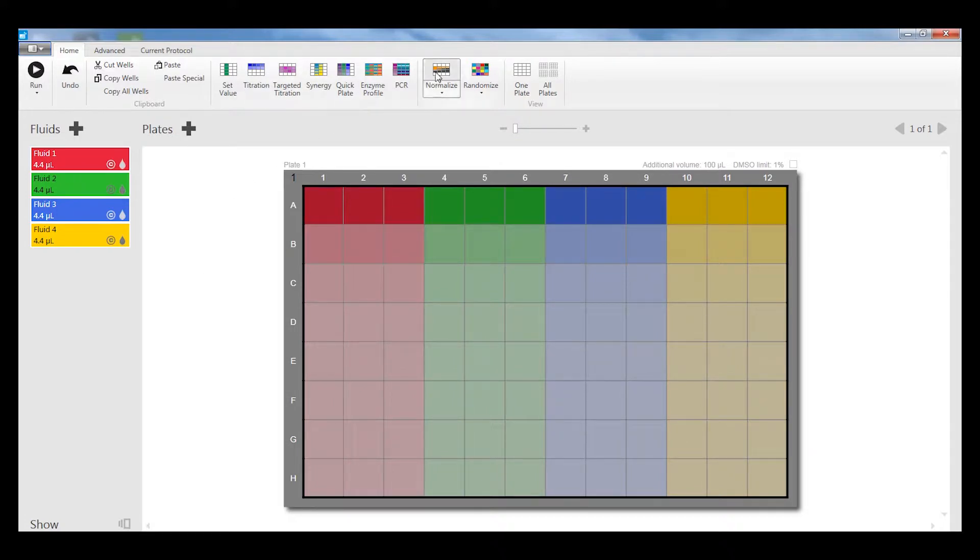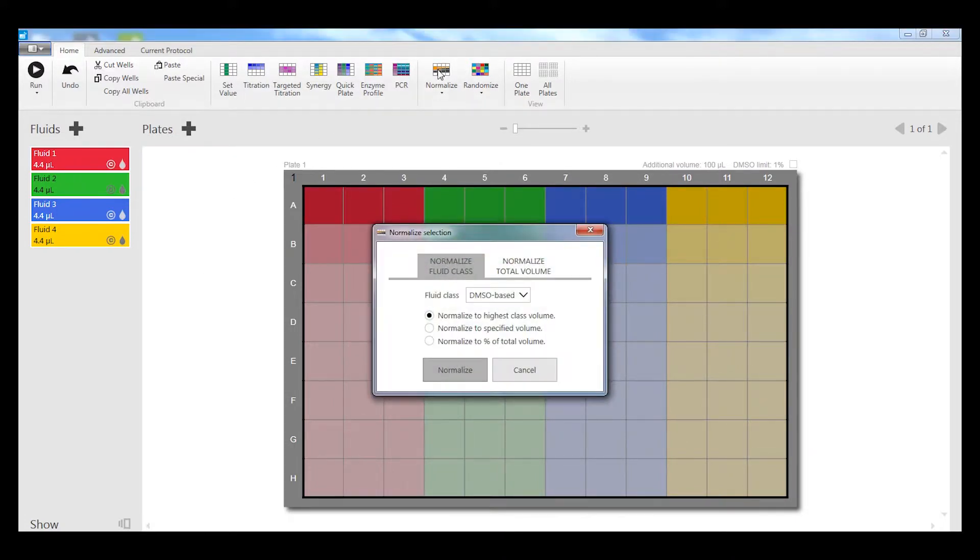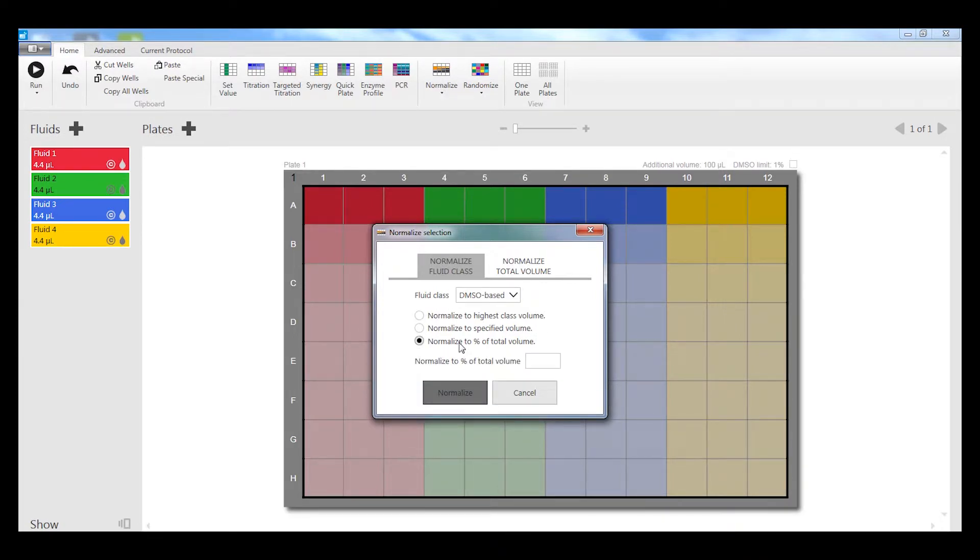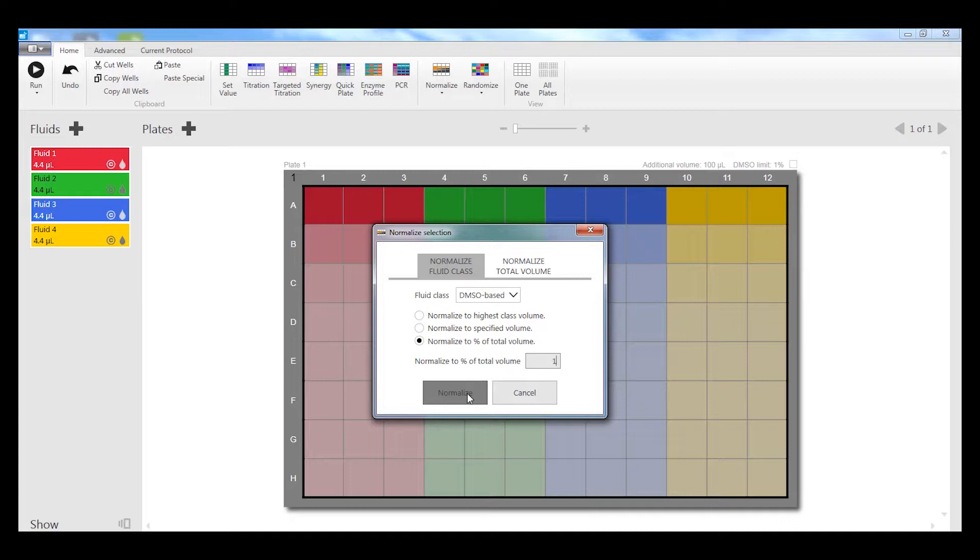Next I come up and click on the normalization function, and there are different ways to do normalization. In this case we're going to click on normalizing to a particular percent of total volume, and we're going to select one percent as our normalization amount.